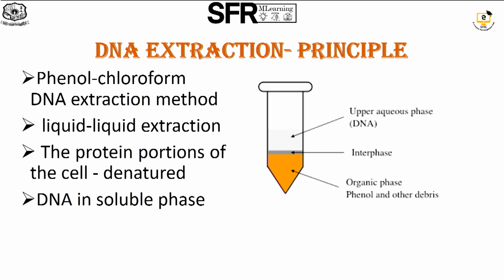This is done with the phenol chloroform extraction method, where we use two phases of liquid. Usually we are adding to the DNA sample the phenol and chloroform mix of 1:1 ratio, and this is based upon the principle that phenol will remove the hydrophobic interaction of protein and it will precipitate them in the interphase. The lipid will dissolve in the organic phase and the DNA will suspend in the aqueous phase.